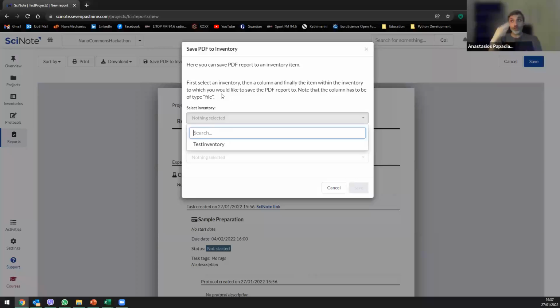If you think about it, this is a very good way to store your metadata along with your data and link them to a specific sample. So when you send the data template to a database for uploading, you will have a full data and metadata report linked to your specific sample.